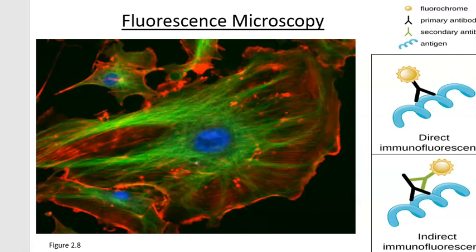And what goes on with fluorescence is you actually shine the specimen with UV light, and the fluorescent particles are going to emit visible wavelengths of light, and you can actually get multiple different colors coming out of there. And here we can see there's actually three different colors to these things that are coming out of here. So we can actually visualize the nucleus and then some elements of the cytoskeleton in green and also in the red here. They're all being painted by using different kinds of fluorescent chemicals here.